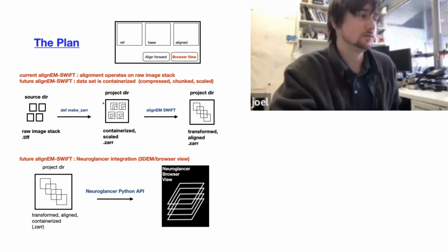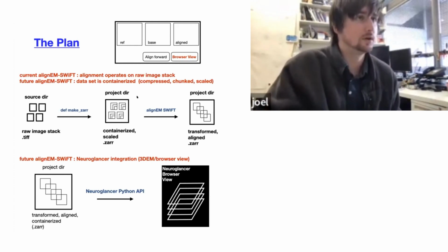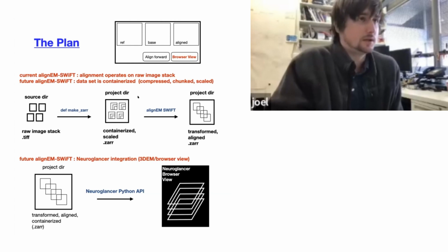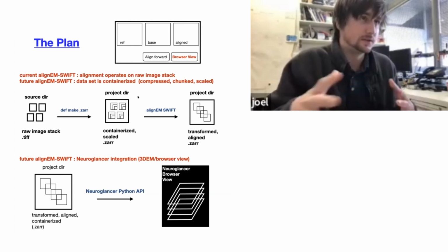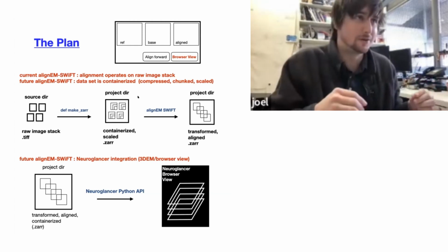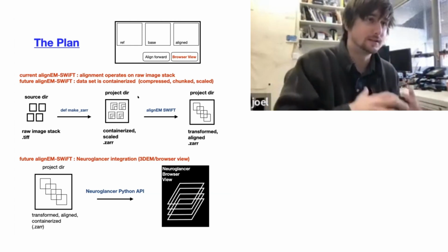Each bucket's going to have one of those, and so that's one benefit, that you have this metadata associated with the container of your images. But I don't know why I led with that, because that's maybe the least cool thing that containers can do. With a container, it's also going to take care of the chunking.